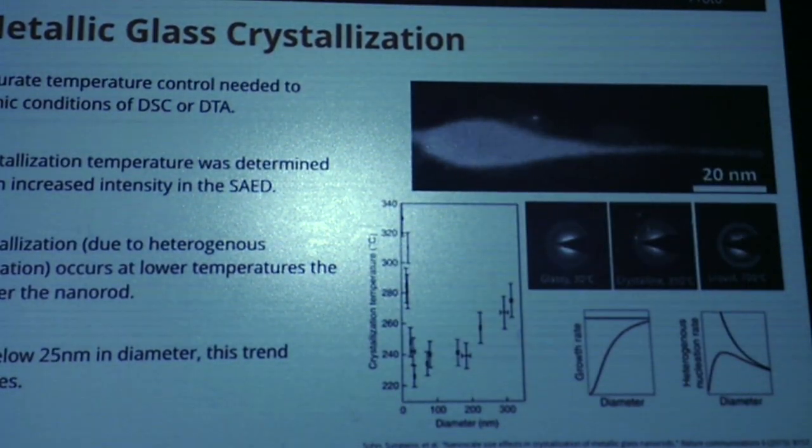What they were able to do pretty easily, and we have folks do this pretty routinely now, is heat the sample up and witness some phase transformations. You will get to see a demo of this later today, not a specific sample, but something similar to this. But as you heat these glassy nanowires, you can see in just the diffraction pattern that they start in an amorphous state, so you have the rings that you would expect. And with the spontaneous onset of crystallization, you're seeing diffractive peaks.